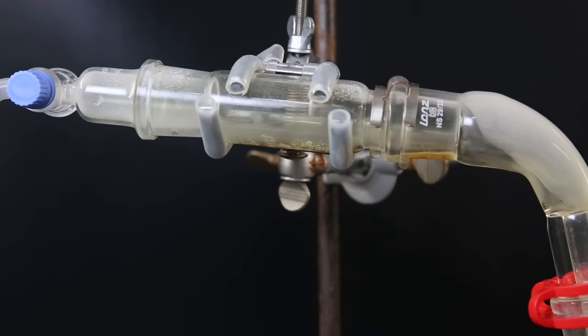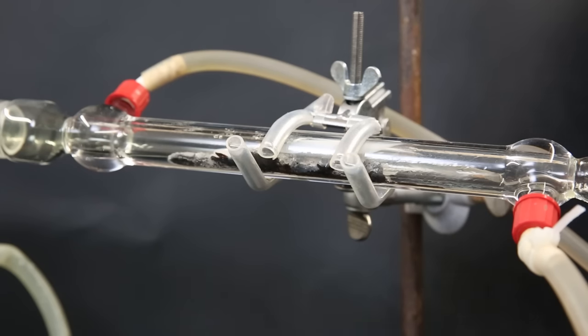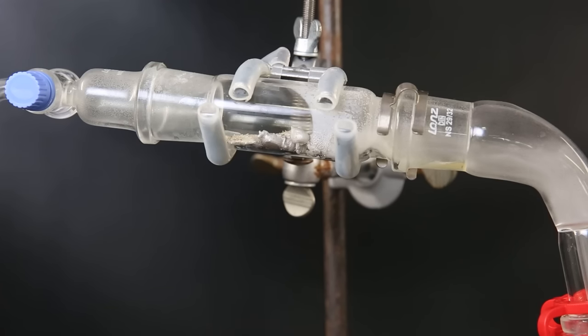After a while, pretty much all of the tin in the adapter has reacted. When I was producing the arsenic 3 chloride in my last video, it wasn't this hot and the chloride mostly became a liquid right away. But this wasn't the case here. The tin got so hot that it melted and all tin 4 chloride vaporized right away.